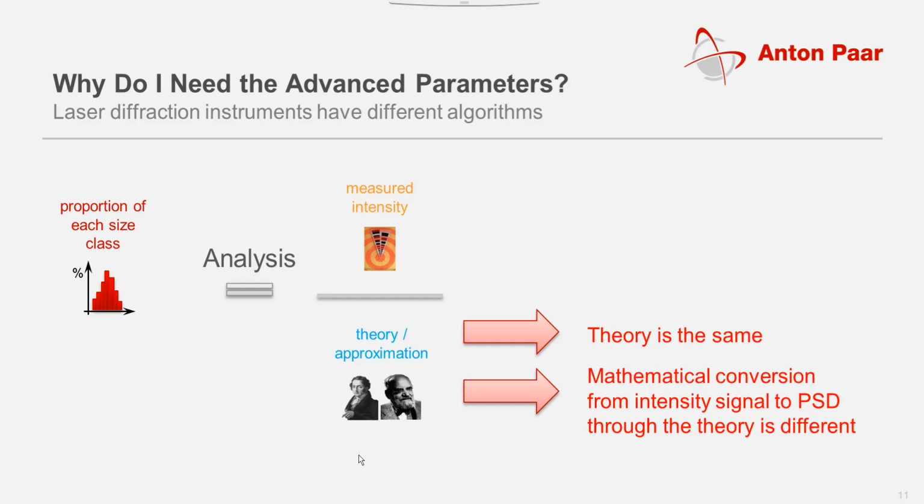As a result of this regulation, each algorithm is able to calculate in a highly comparable way the particle size of spherical standard particles. However, in case of non-spherical irregular shaped particles, the existing difference between the algorithms can determine also different results.